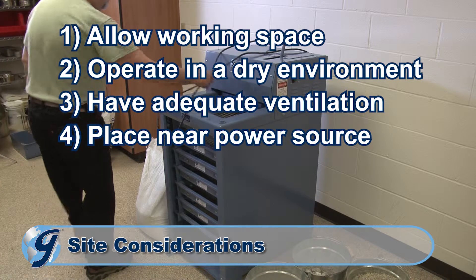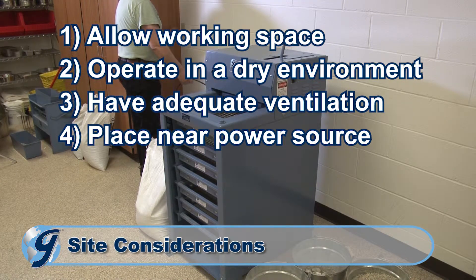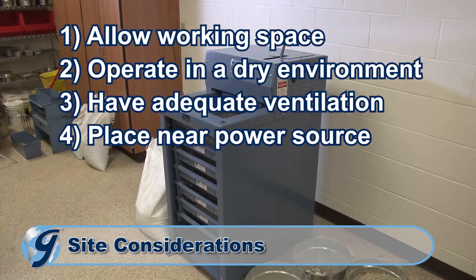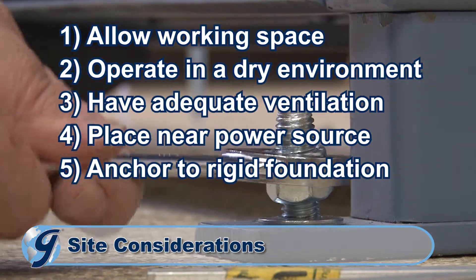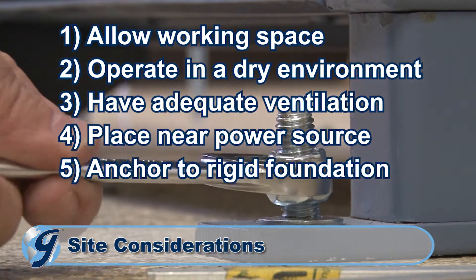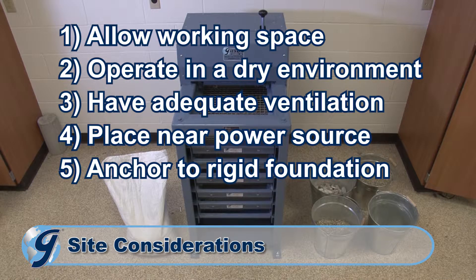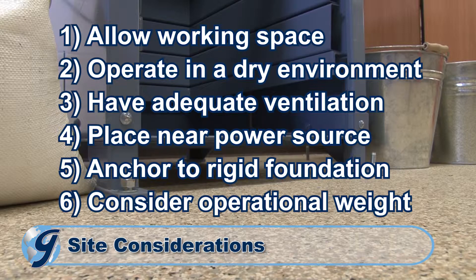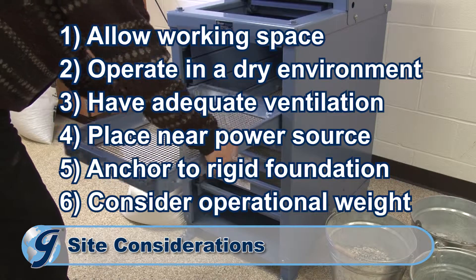Be sure to locate your testing screen near an existing grounded electrical outlet supplying the required voltage and amperage, and do not use extension cords. Your testing screen should be located and anchored on a level rigid foundation such as a poured concrete floor. Finally, make sure the floor will bear the weight of the machine, the weight of the materials being tested, and the vibratory forces generated by the loaded testing screen.